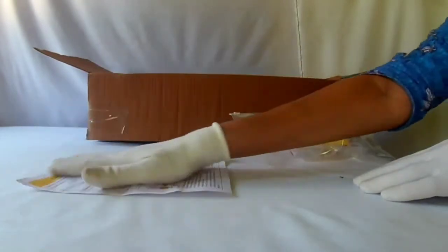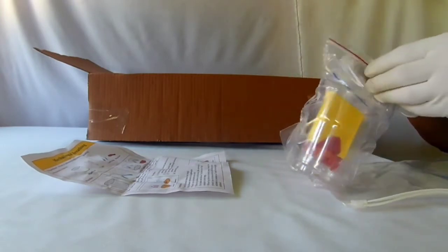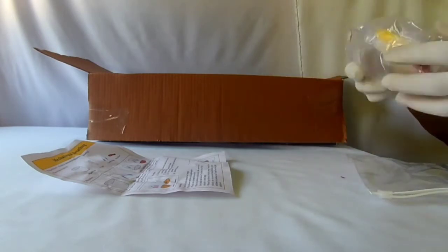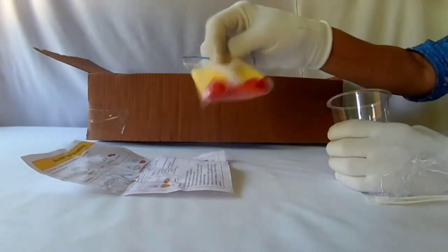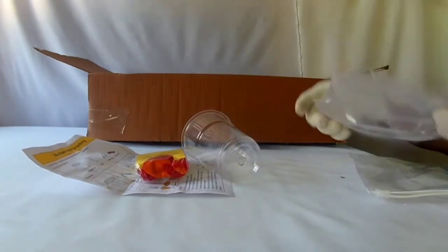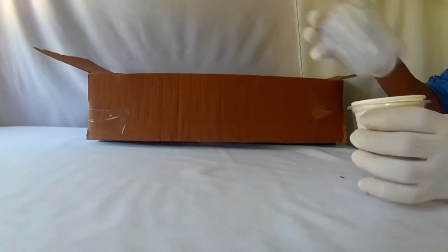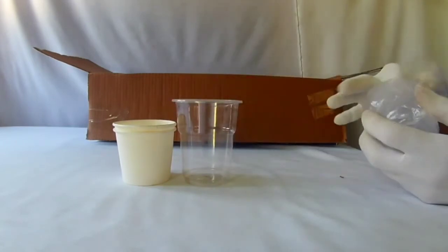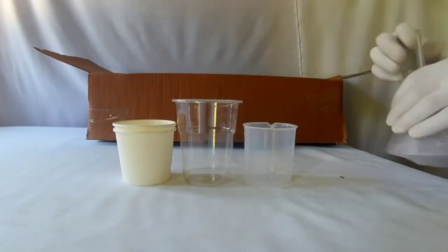Mechanism of breathing. Y tube, balloon, and a small yellow boat, and a plastic glass. Paper cups, a plastic glass, a beaker, a funnel.